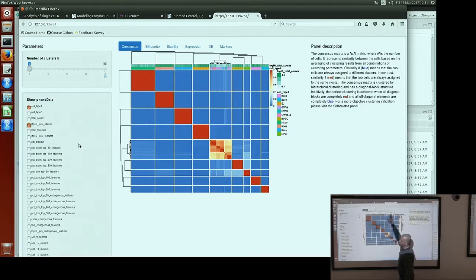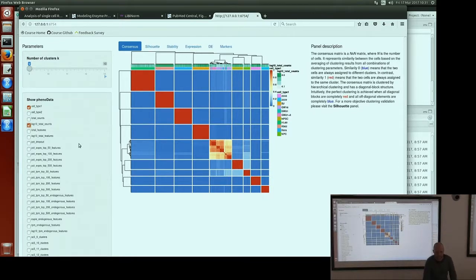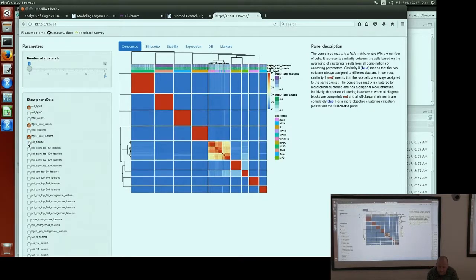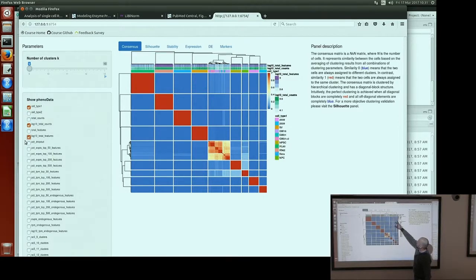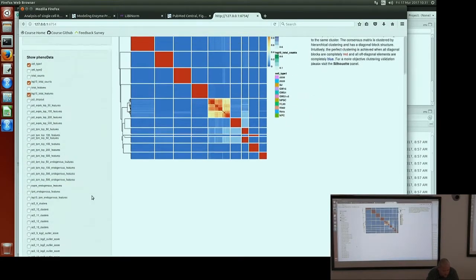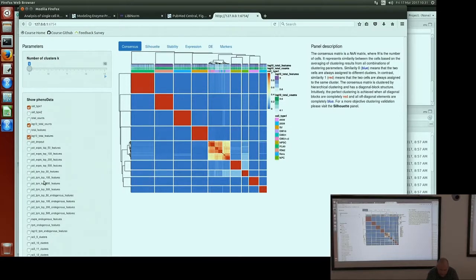Usually you would like to have a uniform distribution of counts. You can also look at total features — the number of expressed genes in your cells — which correlates with total counts. All the information inside the SCATER object is available from SC3. The silhouette plot, stability, and expression views are all available.